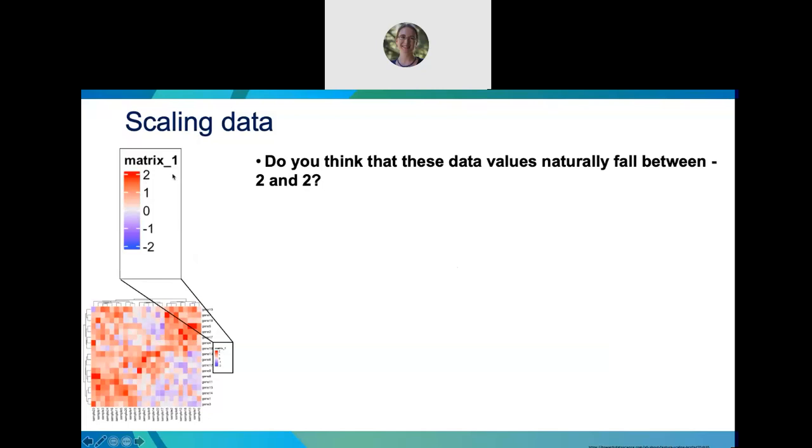Imagine trying to map that many different values onto a color bar. I'll tell you what'll happen. It will crash your server. It will crash your Jupyter notebook. It also is very difficult to even look at a plot like that, because the lower values will dominate the plot, because most genes have close to 0 expression, right? So your entire plot is going to be blue with a tiny little bit of red. Very difficult to see actual relationships between genes in that way.